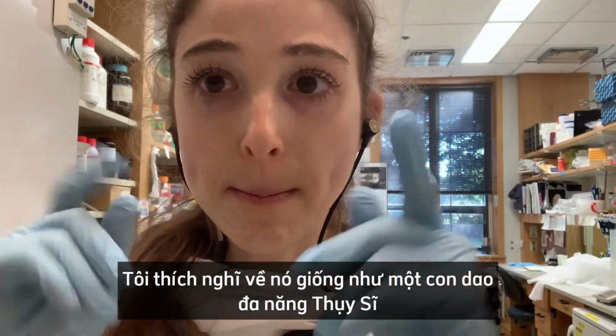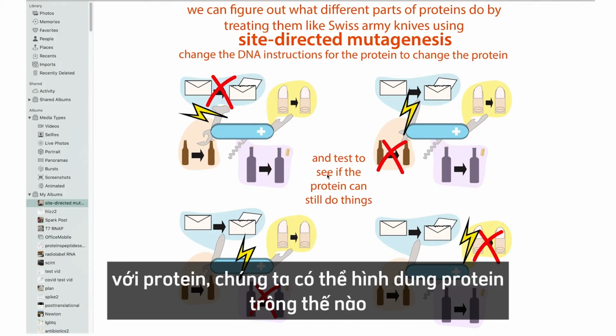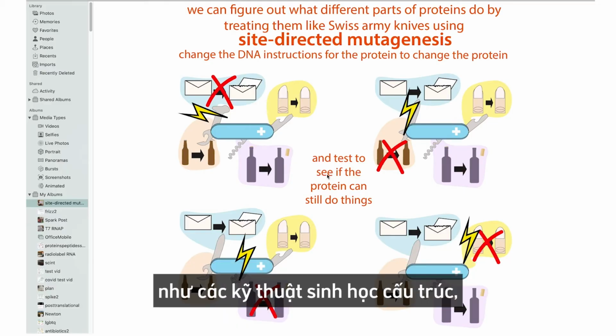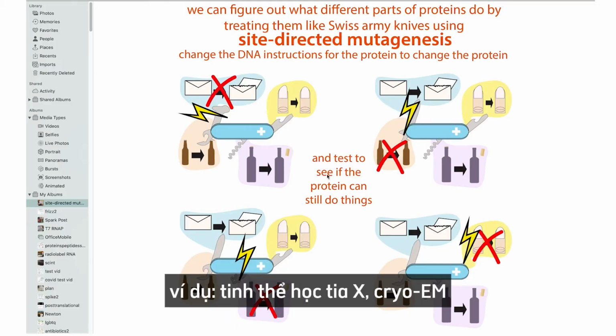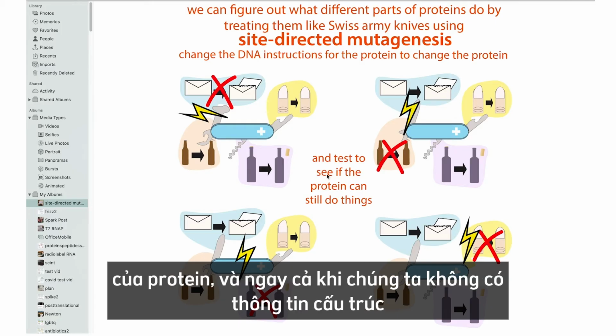Okay, so let's go. I like to think of it a bit like a Swiss Army knife. We can get an idea of what proteins look like using structural biology techniques like X-ray crystallography, cryo-EM, NMR, that sort of thing. And that gives us ideas about what different parts of a protein might do.